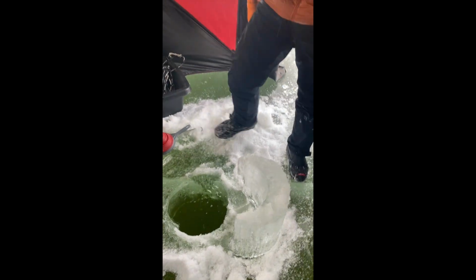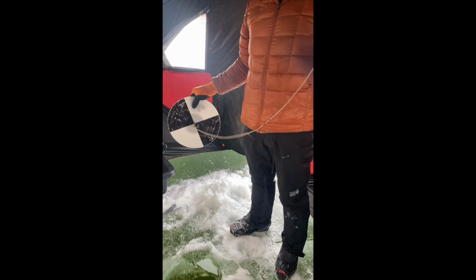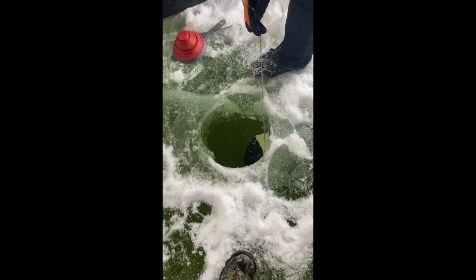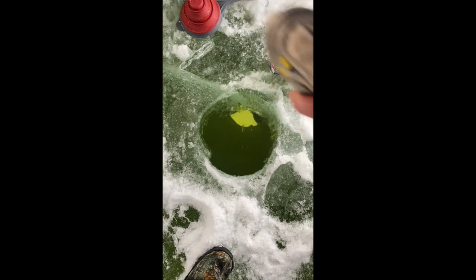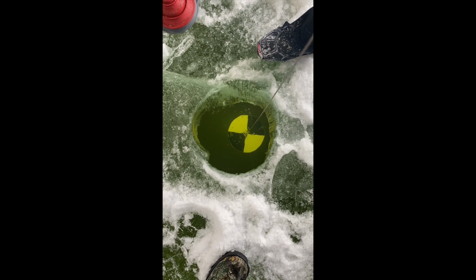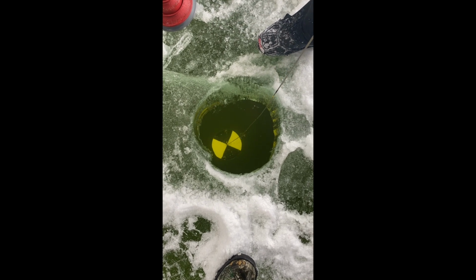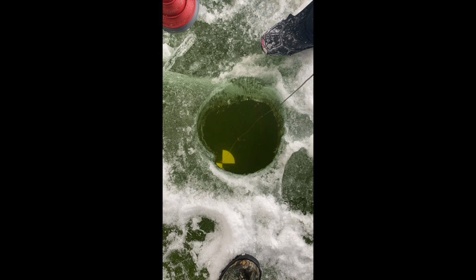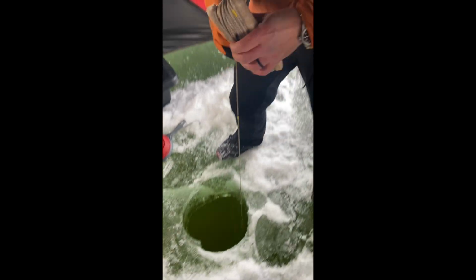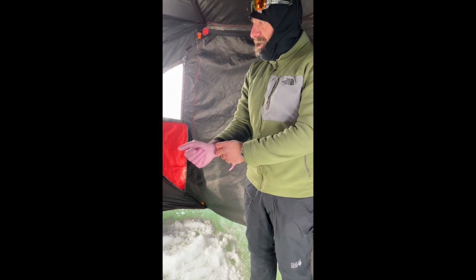Okay, so next we're going to get Secchi depth, and then we're going to collect our water samples. Our oceanographic style giant Secchi disc. Kind of neat because in the summer this lake's Secchi depth is approximately a meter or so, but it looks like it's going to be, I don't know, maybe 4 or 5 meters now in the winter. About 7.1 meters for Secchi depth. Yeah, again, 7 times more than in the summer. Pretty cool.